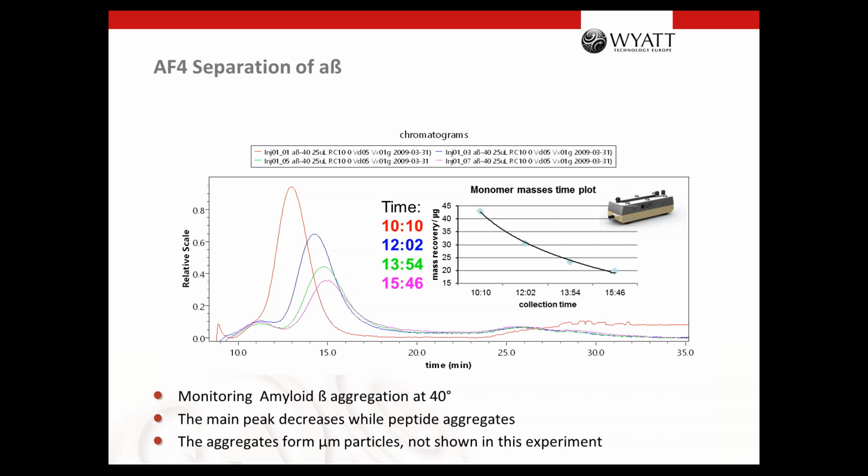You can be unlucky and it takes a few days. It always depends on whether it works with the normal standard membrane. If the recovery with the standard membrane is okay, then you do not need to screen different membranes. It is also a question if the buffer you choose for the first runs is suitable for the protein.